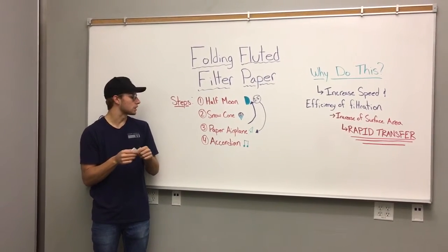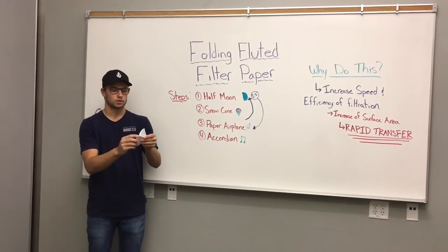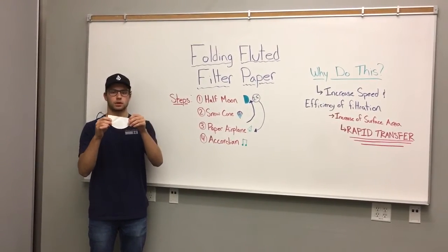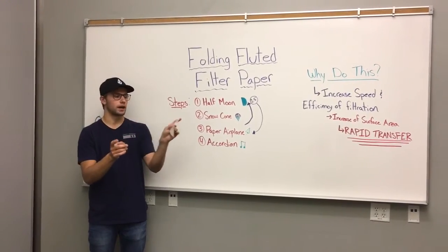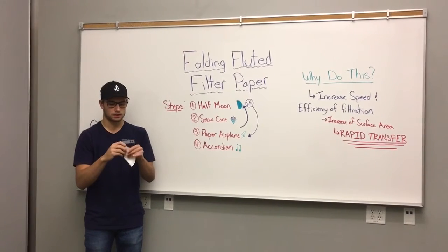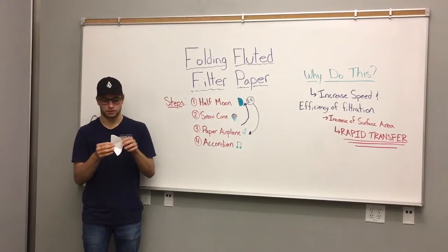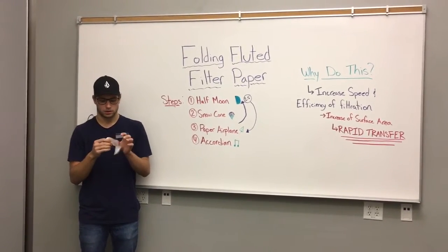Now we're moving on to step 4. We are going to make an accordion fold. So we're gonna open it up, show our folds, and start from one end — I'm just gonna fold back and forth into eights. Now this is the most time-consuming part of the filter folding.